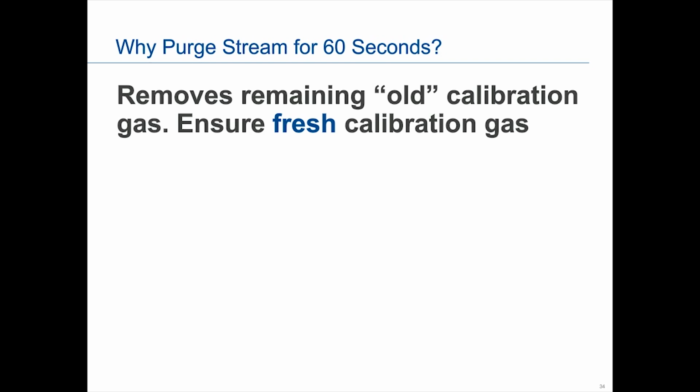You do have the option to modify the purge stream time. 60 seconds is the default, but you can set it up to 600 seconds. Generally, in most applications, those 60 seconds of purge are appropriate.